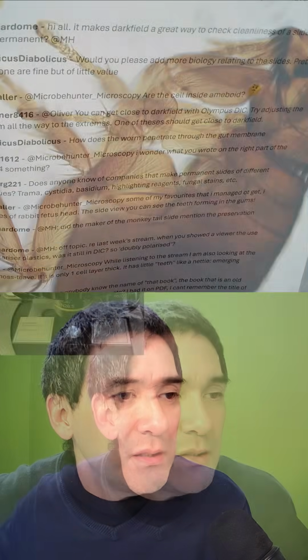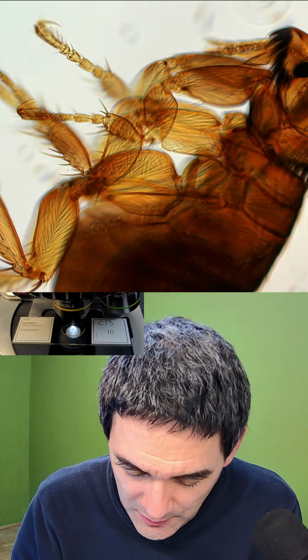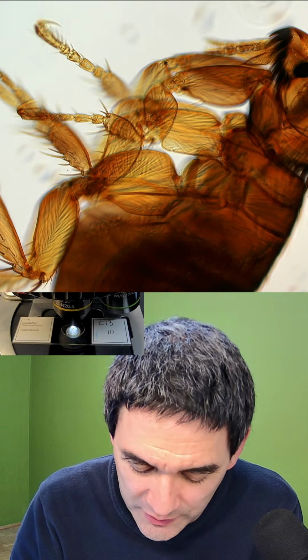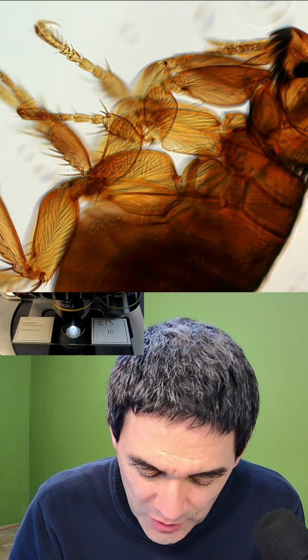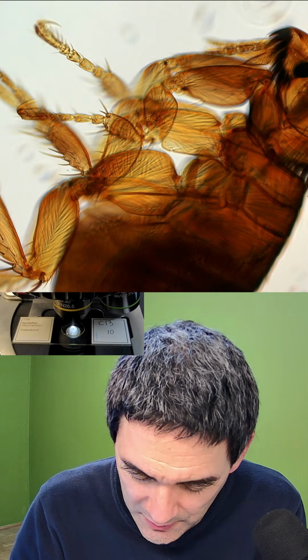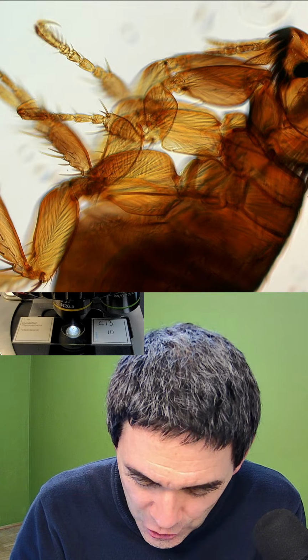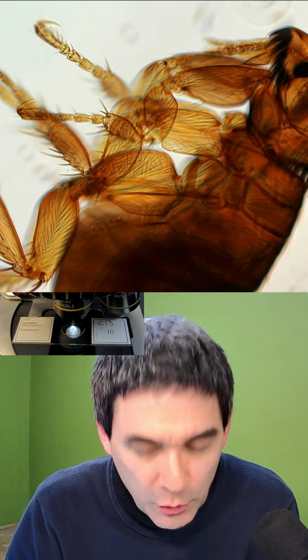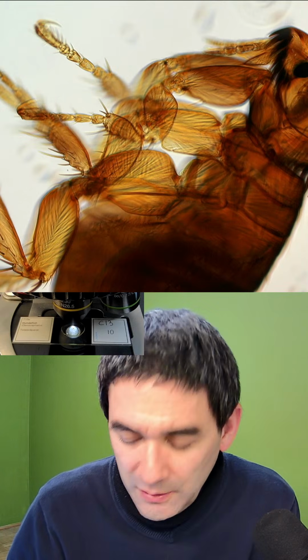We said we want to look at a few things here. Some questions that I already answered about the nematode worm. Then the question about the slide labels. Does anyone know of companies that make permanent slides of different fungal tissues? Honestly, not that I know specifically that they make that, but if this company doesn't have that, then I don't know who's got it.